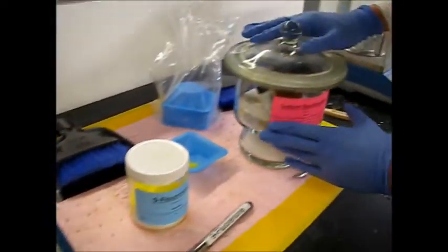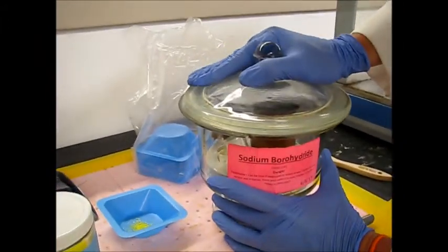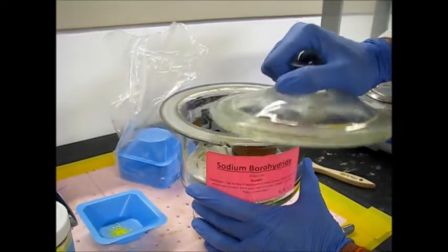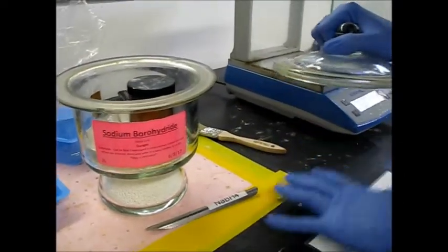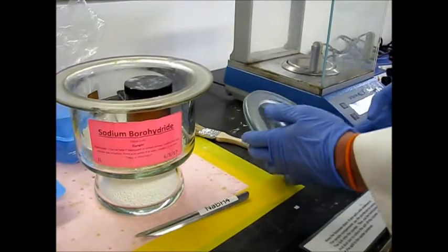Whenever you take off the lid of the desiccator, you want to slide it off. It does have grease on the lid, so it will be a little bit sticky, but once you get it to slide, you want to make sure you don't set it down face down like this, because the grease will pick up all of the junk right here. So you want to set it down just like this.